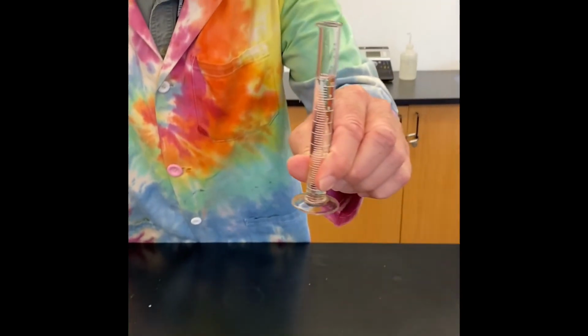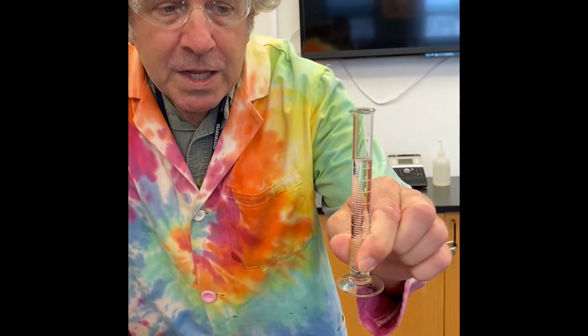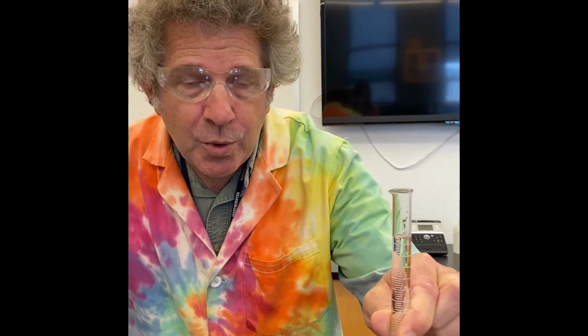So next, I have measured out approximately 10 milliliters of lime water. Now remember, our lab is a qualitative lab, not quantitative, but this is the one step where I actually did have to measure something, but it doesn't have to be real exact. I actually do have a little over 10 milliliters of lime water, but that's not going to hurt anything. Our focus again is qualitative observations.